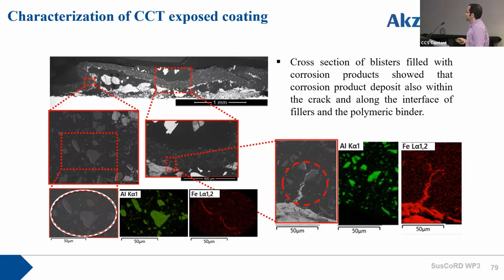And as you can see here, after that, when the corrosion products form, it may result in a blister formation. And as you can see here, probably we have two blisters which are connected to each other. But the other thing that we observe, first of all, is formation of cracks at the periphery of these blisters, as you can see here, which are now also filled with corrosion products. I will discuss this a little bit in the next slides.